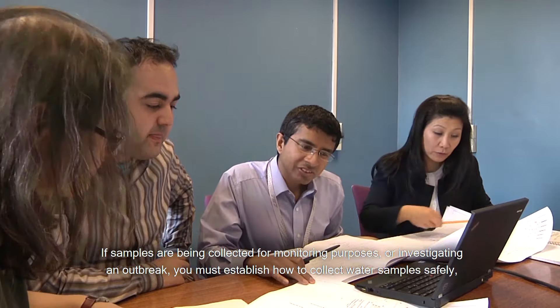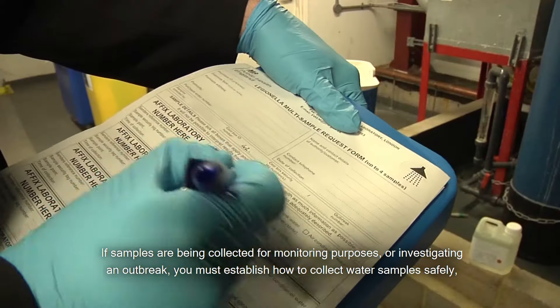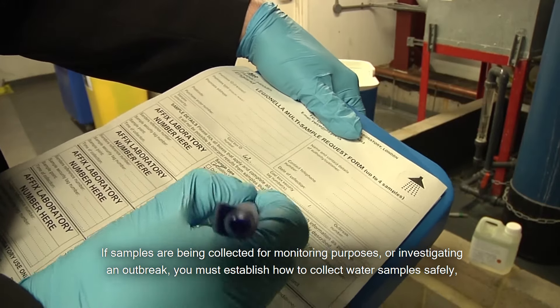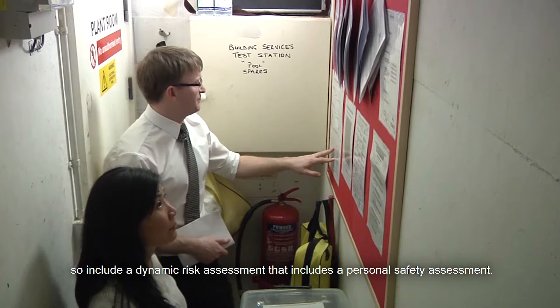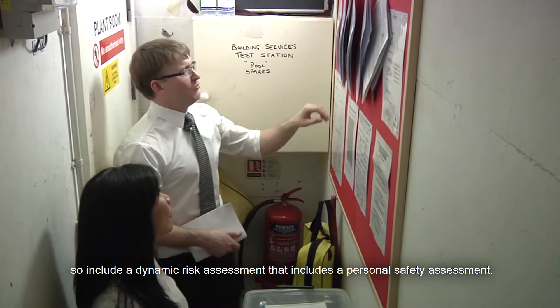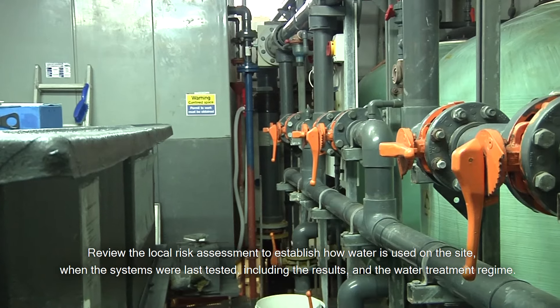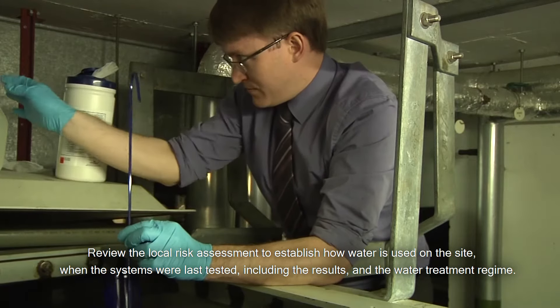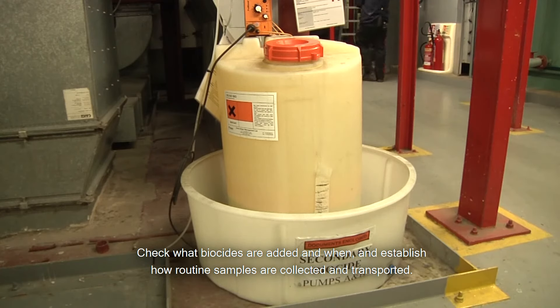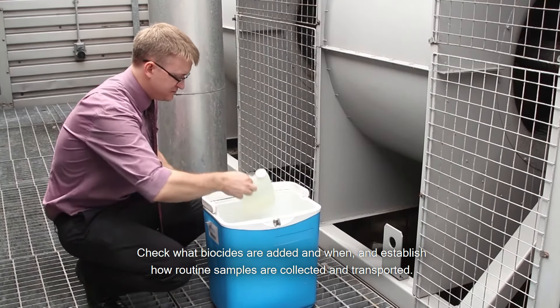If samples are being collected for monitoring purposes or investigating an outbreak, you must establish how to collect water samples safely, so include a dynamic risk assessment that includes a personal safety assessment. Review the local risk assessment to establish how water is used on the site, when the systems were last tested including the results and the water treatment regime. Check what biocides are added and when, and establish how routine samples are collected and transported.